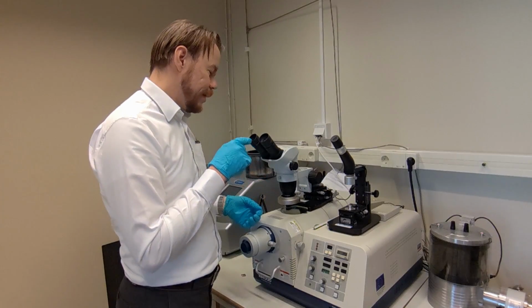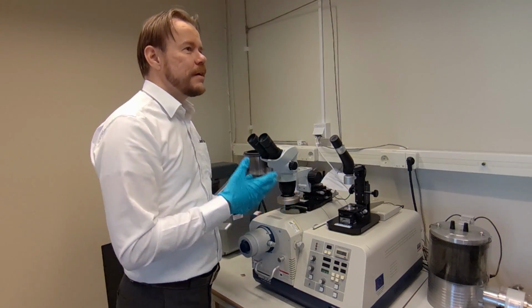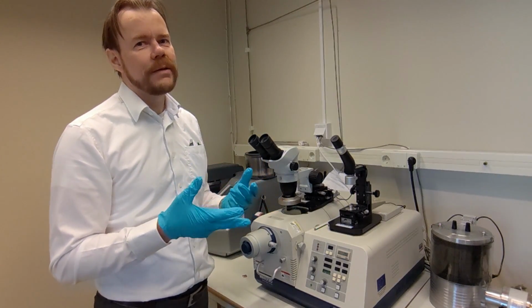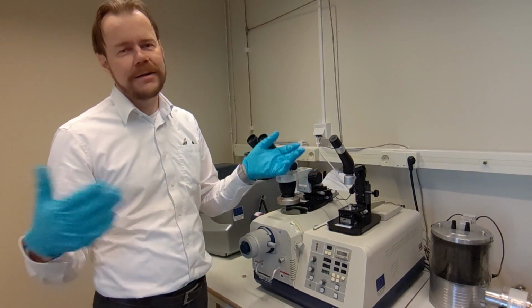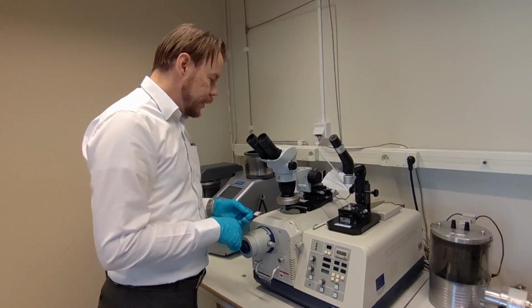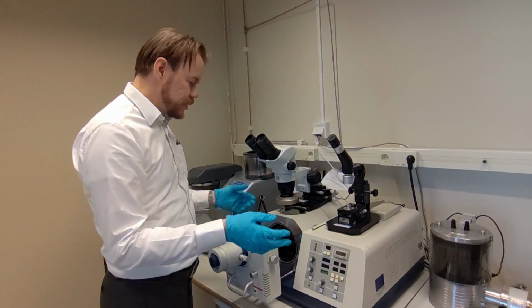And that makes it, what shall I say, a completely necessary tool for when we're working with paper or fiber-based material, because fibers are like hundreds of microns. So you need this very full width. The machine is like a bench tool like this.